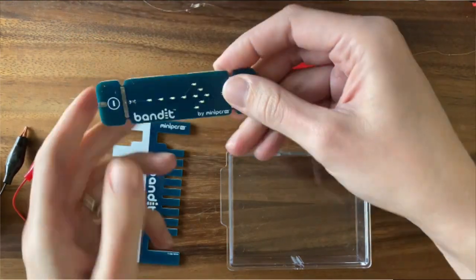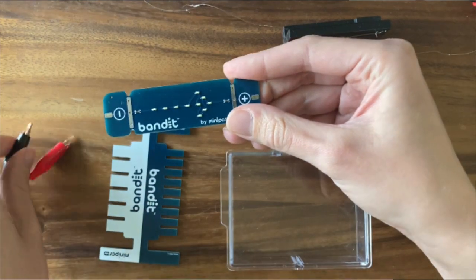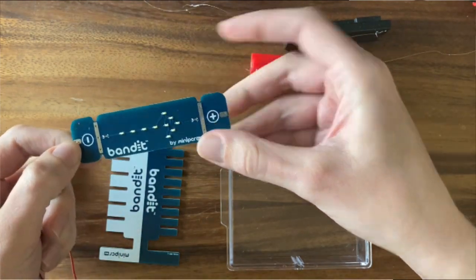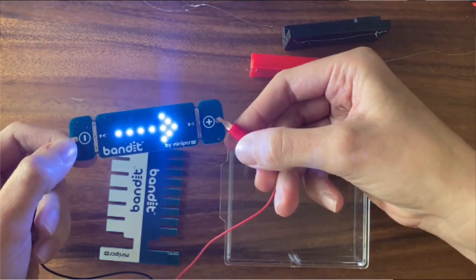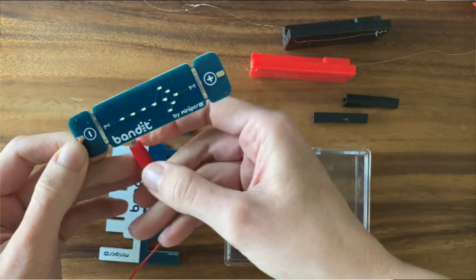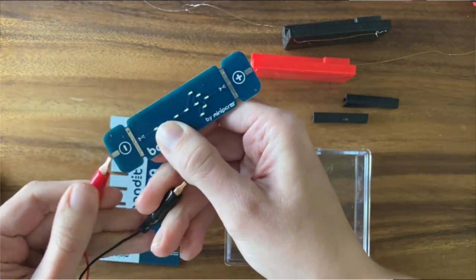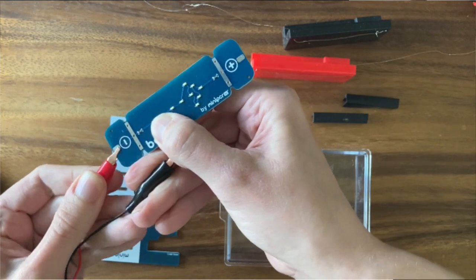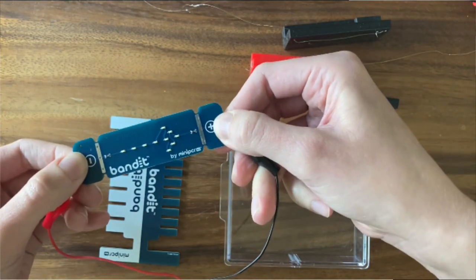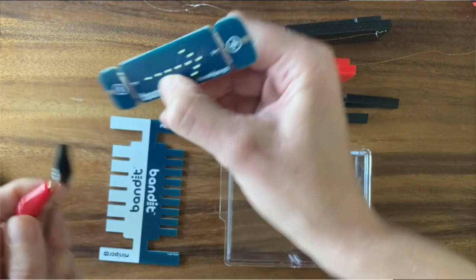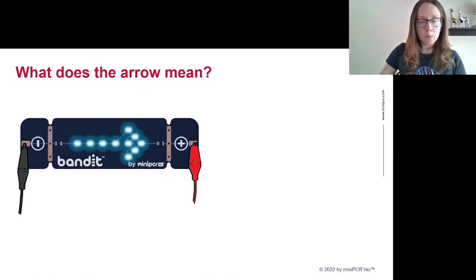This is the LED strip that we'll be testing with. It has these little metal plates at either end. I can just clip my alligator clips onto these metal plates. And there we go. We've lit up the test strip. Now notice, though, if I switch the order and I put the red clip at the negative electrode, or if I put the red electrode at the negative end of the circuit board and the black one at the positive end, the arrow does not illuminate. That tells us something about the polarity of our alligator clips.